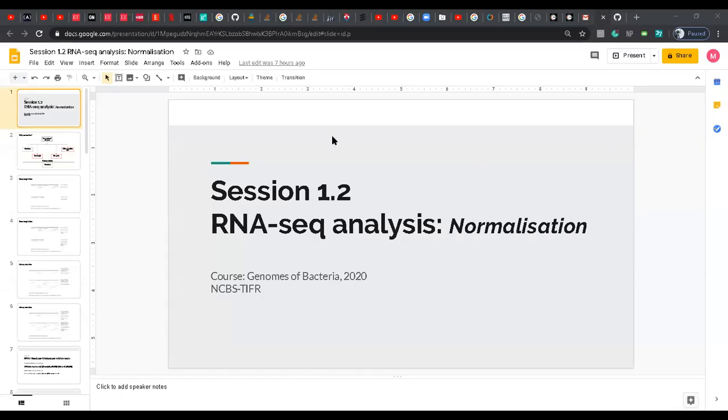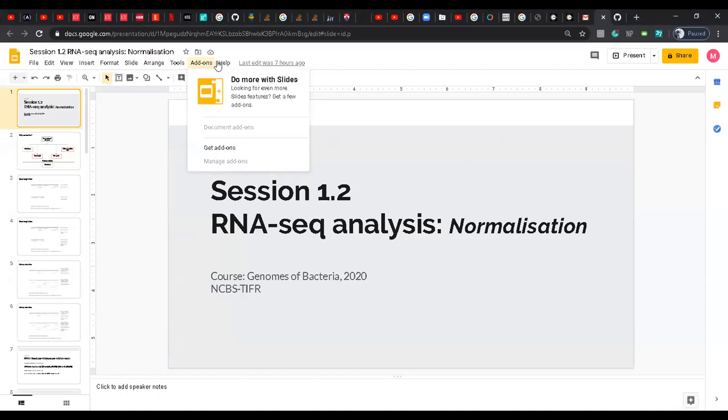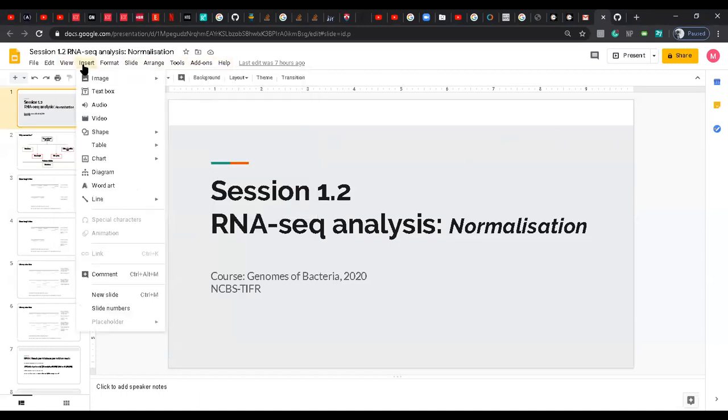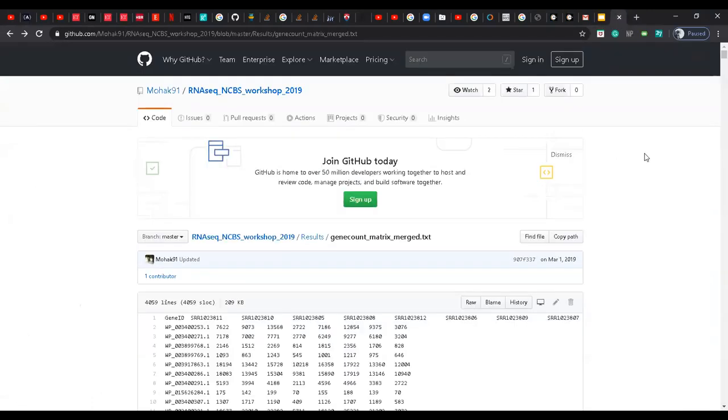Yeah, so can you guys see the screen? Yes. Okay. So yeah, I'll just show you. Can you guys see this table?